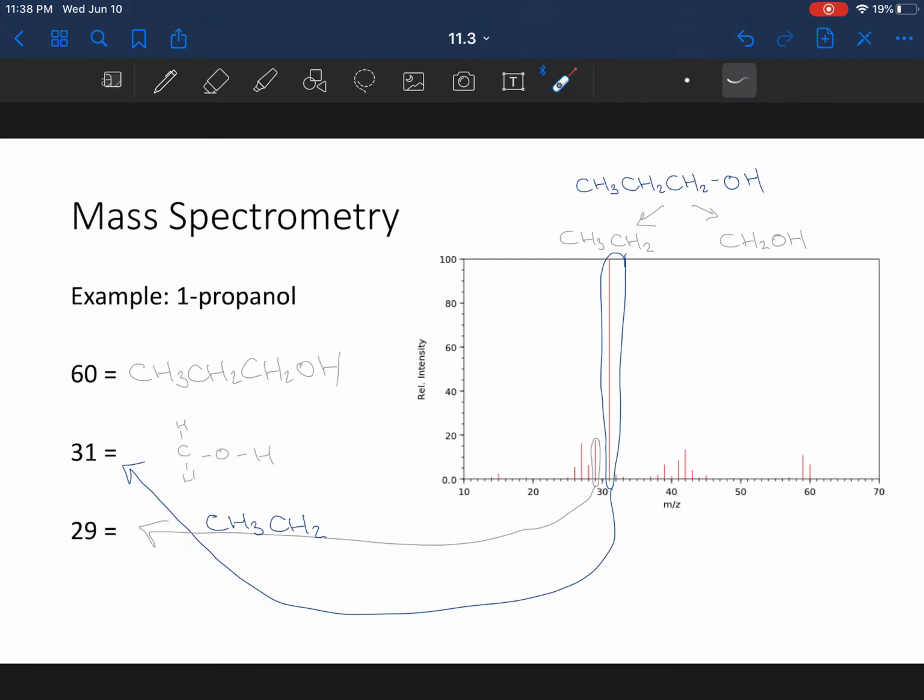Okay? So the whole idea of a mass spectrometer is that it takes a compound and it breaks it into different fragments. What we're doing is just concentrating on these two fragments to see, of course, that, oh yeah, I know where these two numbers are coming from. This is representing this fragment. This is representing this fragment. Okay? Then you maybe want to ask, what about the others? How come we never talk about the others?